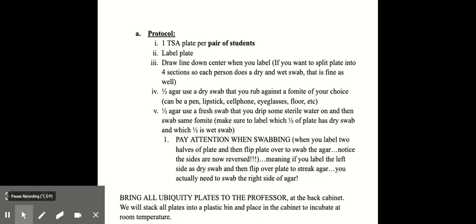And pay attention when swabbing, when you label the two halves of the plate and flip them over, the sides are now reversed. So if you label the dry side on the left, you make sure that that's the one you swab onto the left side. And then you would bring all the plates to me if we were in the laboratory to be incubated.